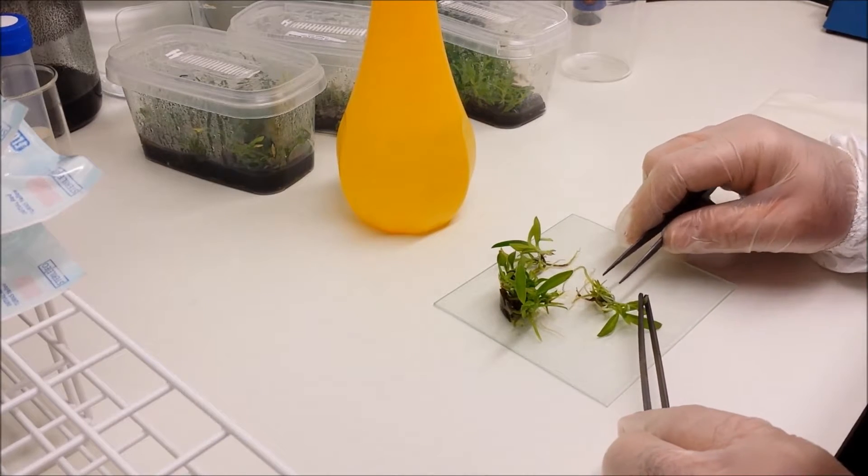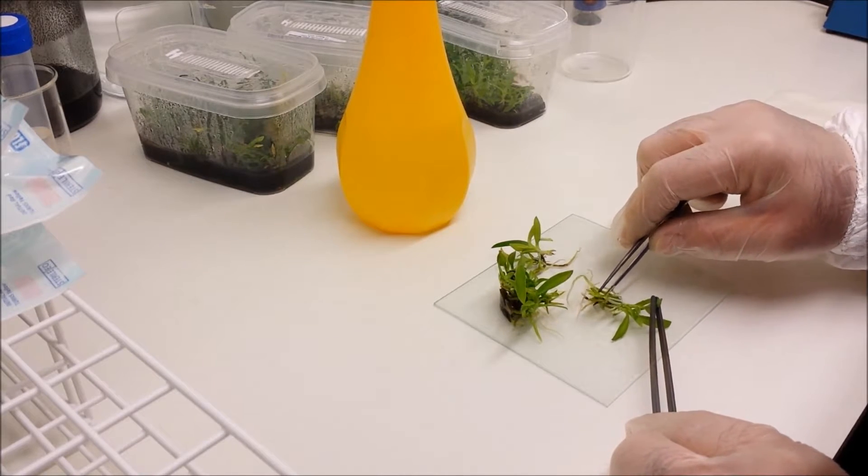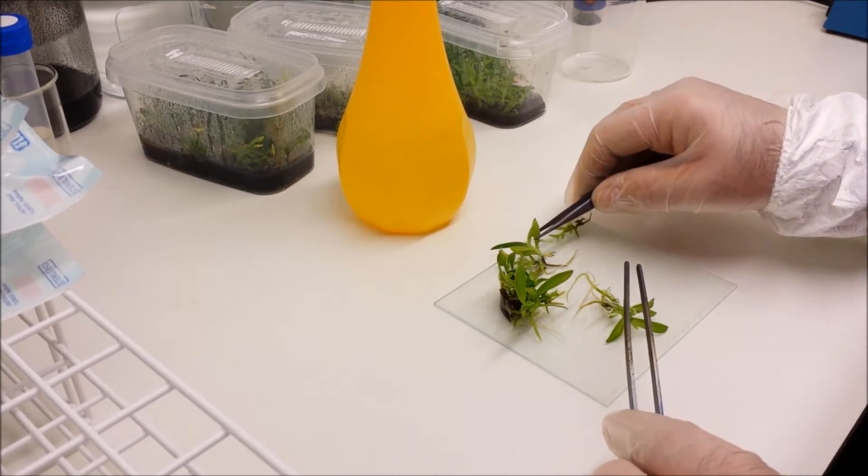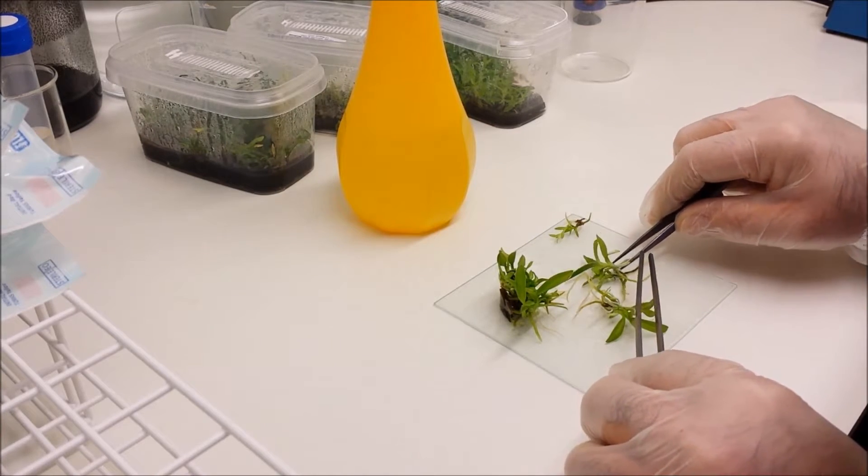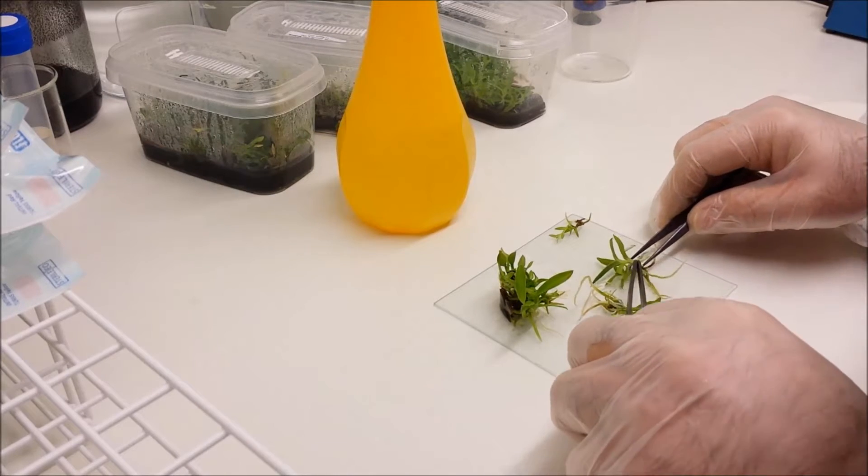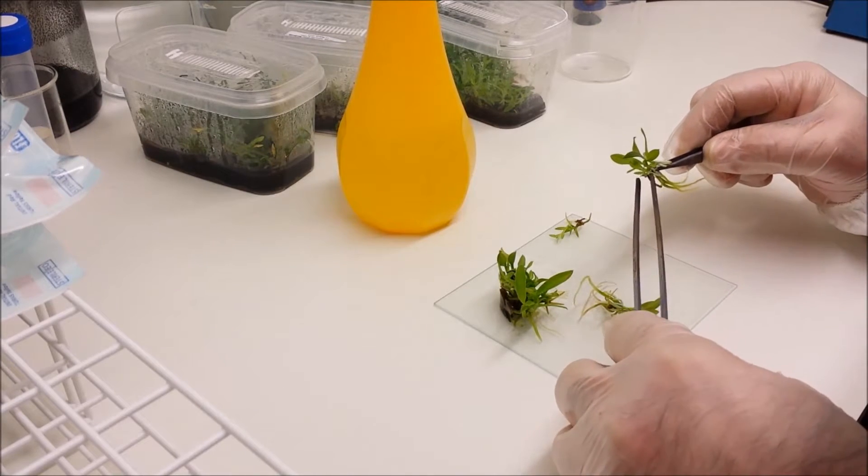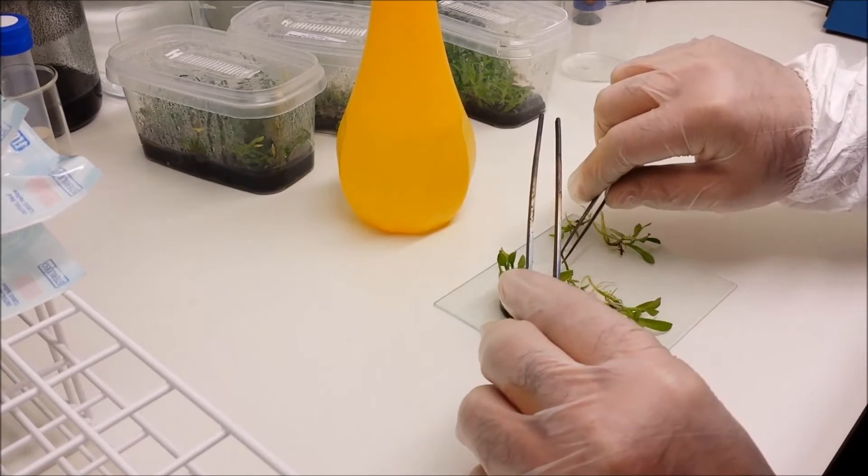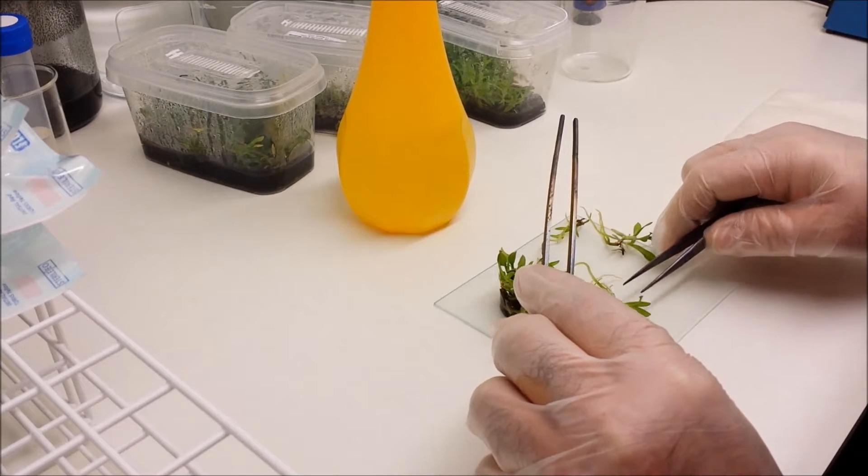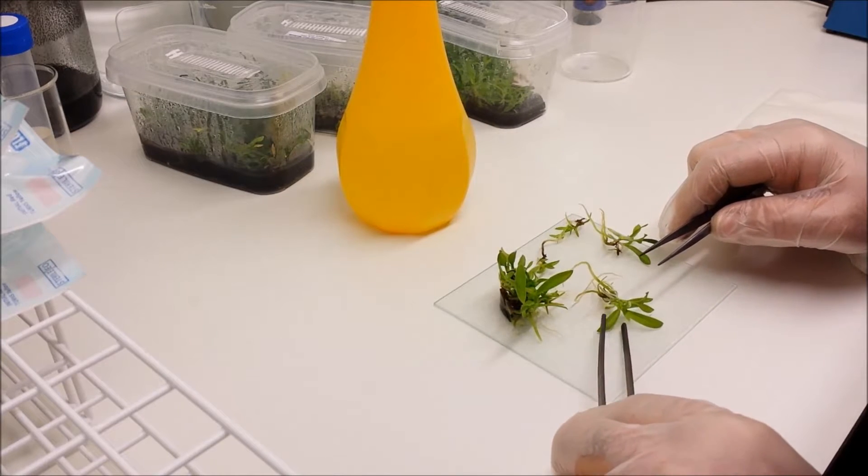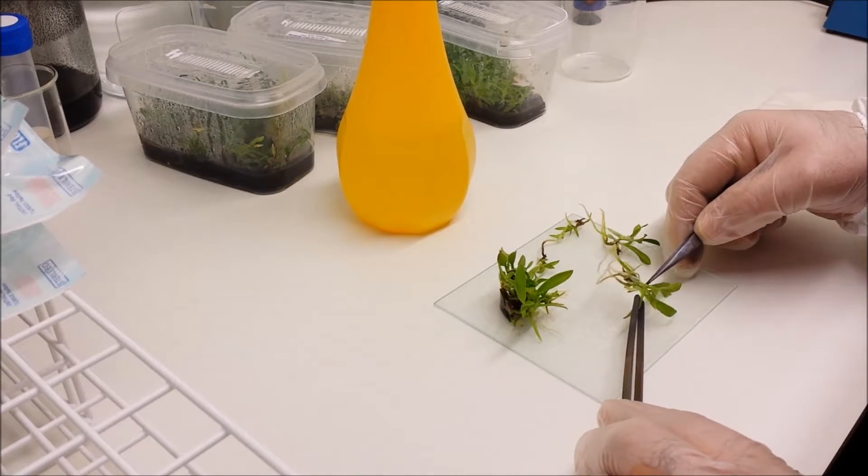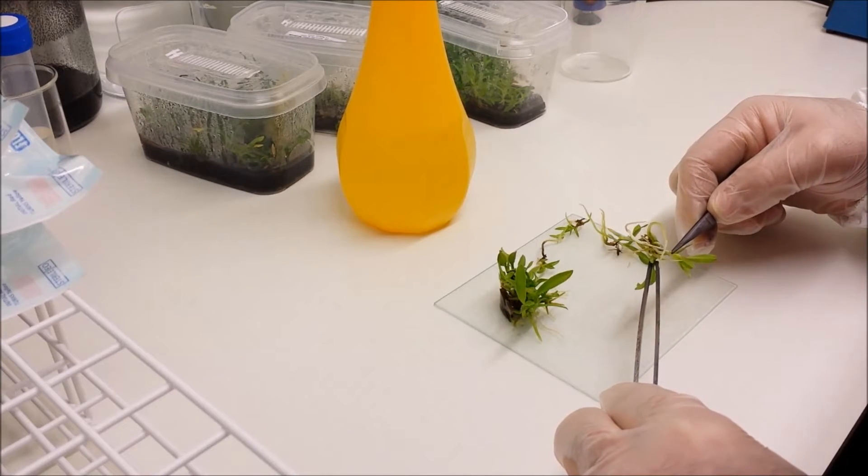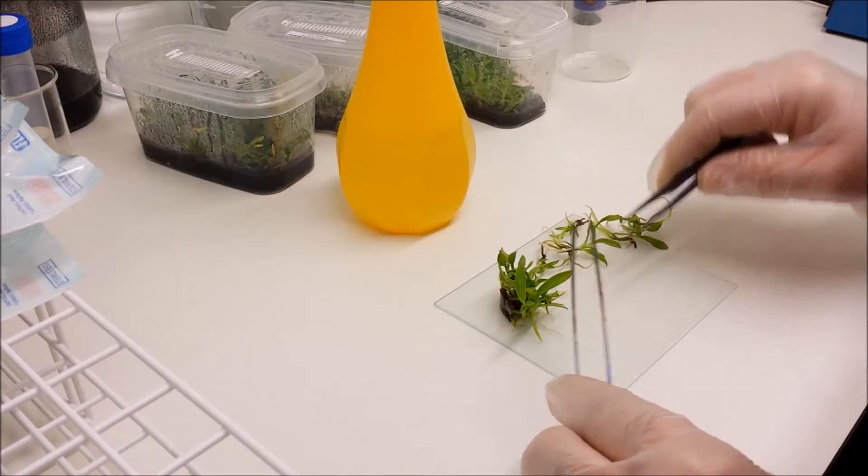So depending on how dextrous you are, you can either use two sets of tweezers to prise the plants apart, or you can use your fingers and one set of tweezers. You'll find that you tend to be a little bit more accurate when you do use tweezers, simply because it slows you down, stops you from pulling. So I'm separating these clumps out into individual plants, being careful not to destroy the stems and not to apply too much pressure as to bruise the plants.